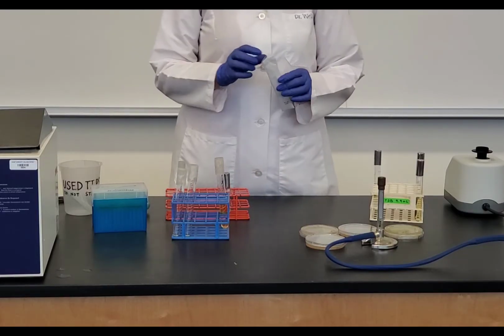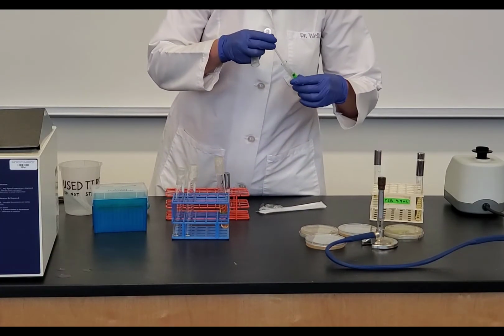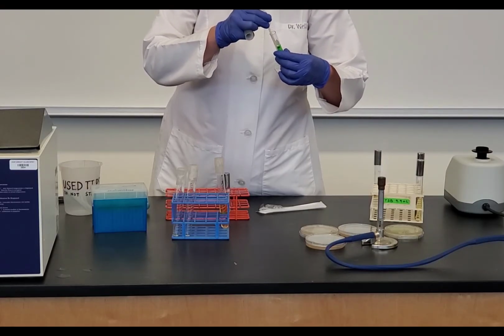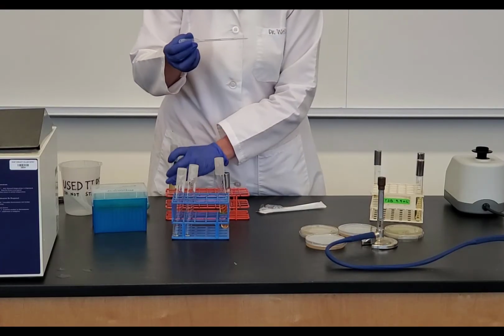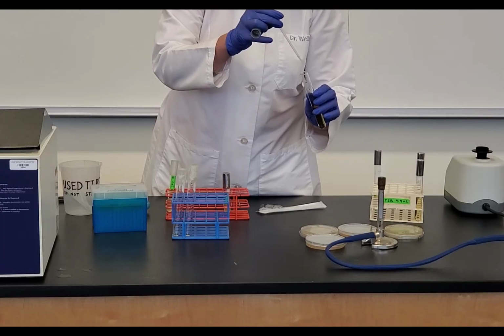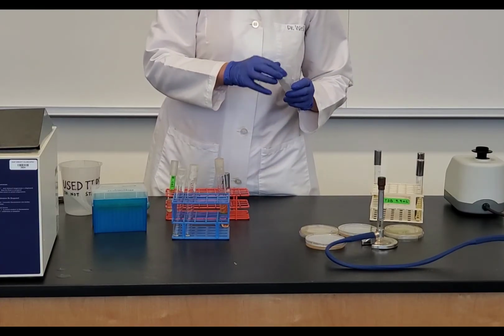And remember, I'm using my transfer pipette, so I'm going to get back out my transfer pipette. And I'm going to flame it. And I'm going to draw up 0.5 milliliter. Okay. Flame it, cap, add it to my agar deep. Flame. Again, don't touch the transfer pipette to the agar that has the virus in it. Flame it, cap, set it down. Put this back in the wrapper.